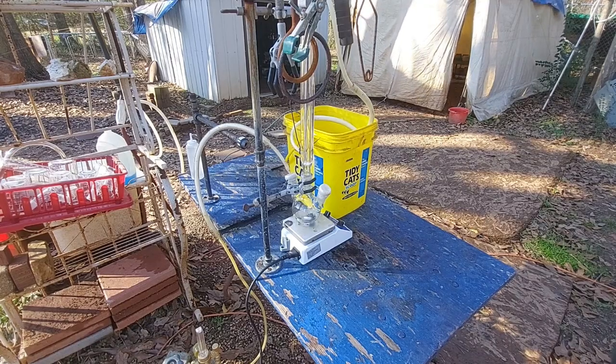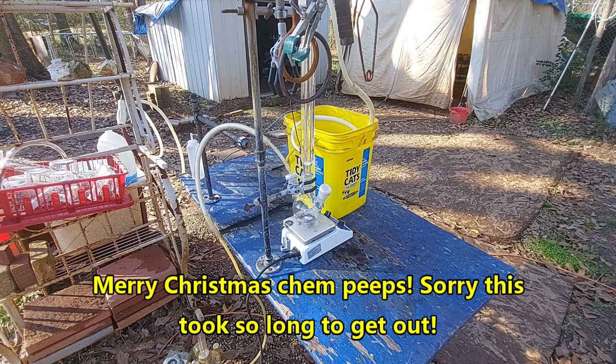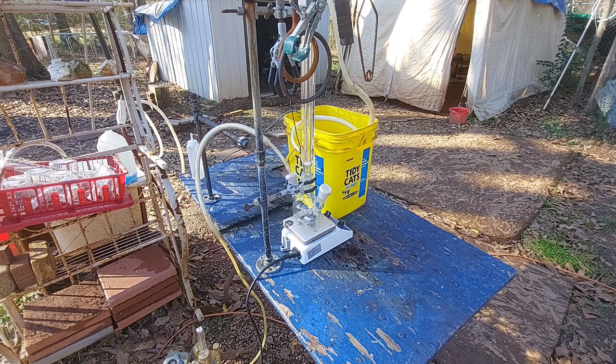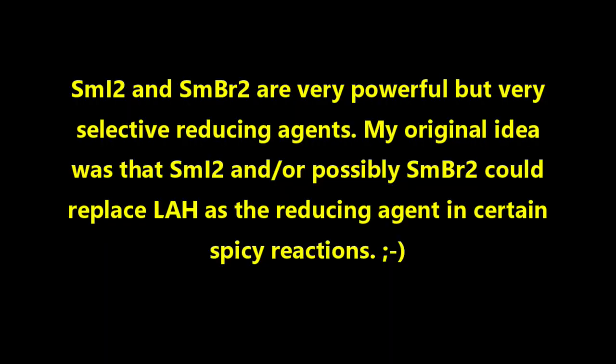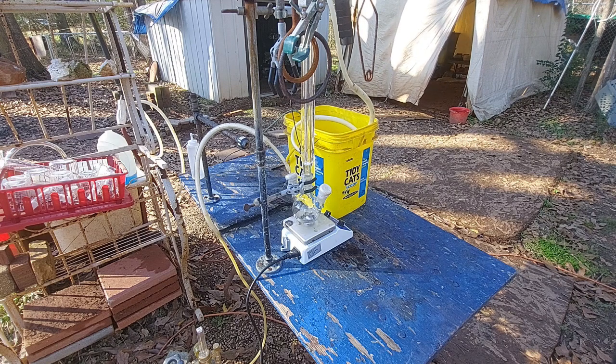Hello everybody and welcome back to the Poor Man's Chemist. In this video I am going to be making my final attempt at trying to make samarium diiodide, or if it all goes wrong we should end up with samarium triiodide that is essentially anhydrous — which would be our consolation prize.